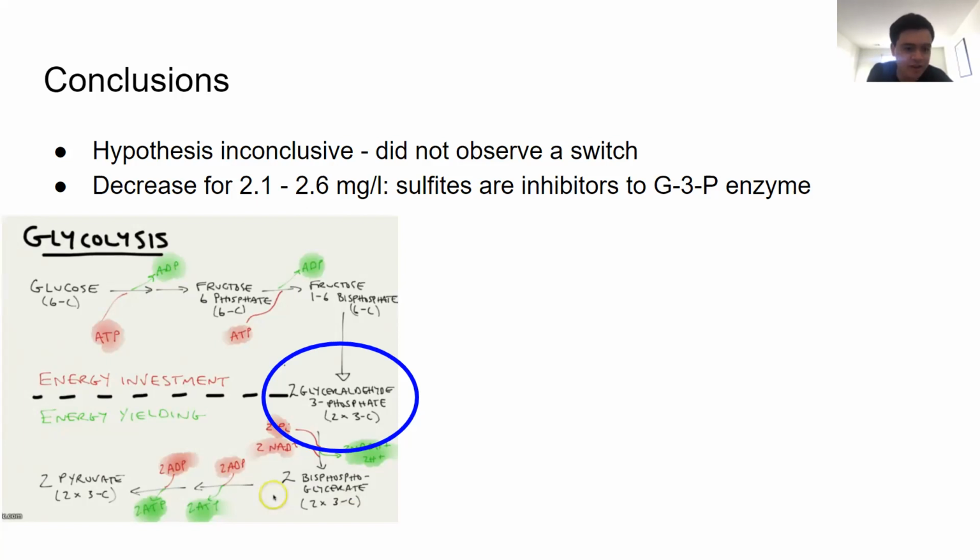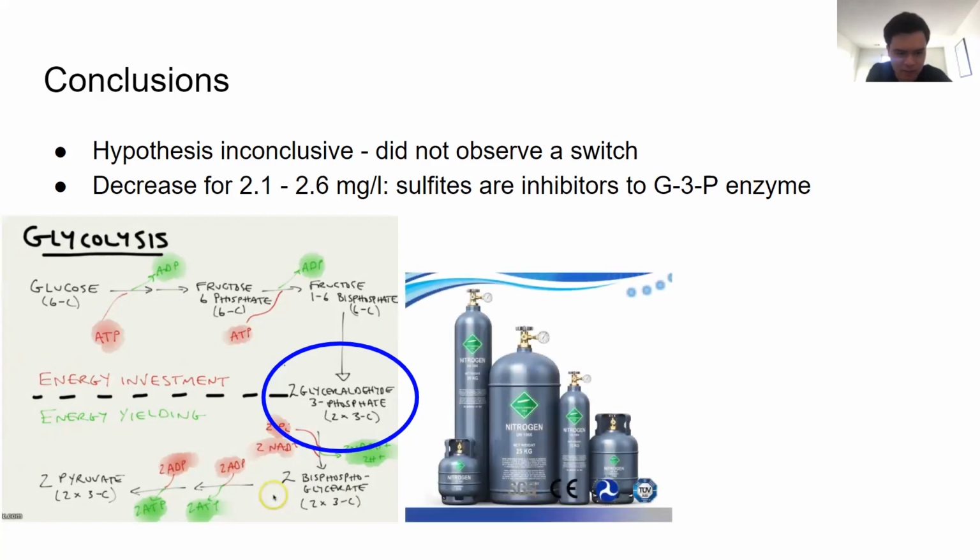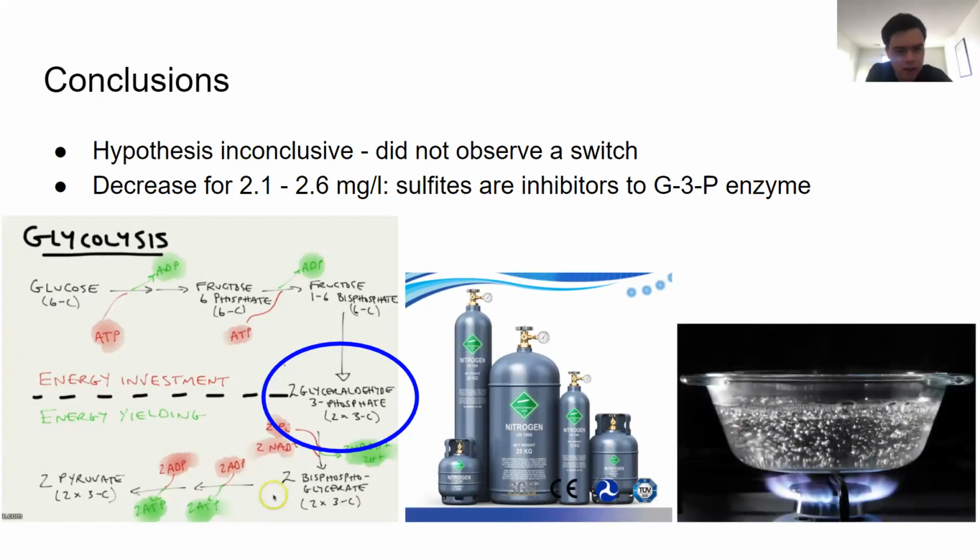We would also have to change the mechanism by which we removed the oxygen from the water. To avoid any of the destructive side effects we observed with the sulfite, we would use a physical rather than chemical method. Two physical methods that have been studied to be relatively effective are purging water with N2 gas, which entails bubbling in nitrogen for an extended period of time, and boiling water in a setting of reduced pressure. To this deoxygenated solution, we would then add the yeast and whatever concentration of oxygen for that level.